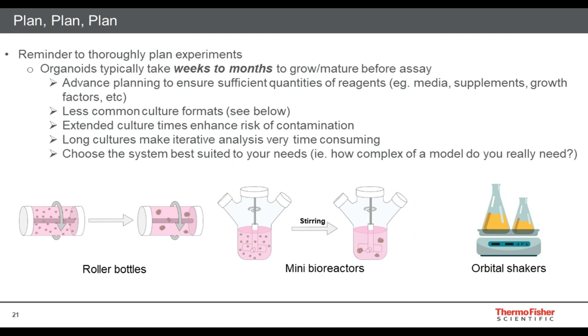The other important feature to remember with respect to the length of these cultures is that these really long or extended culture times really enhance or compound the risk of contamination. And I know in talking to lots of customers and collaborators who work in various types of models, although I'm sure people don't always like to admit to it, the longer you are doing something in cell culture, you're taking things out of the incubator many, many times, your risk of contamination just goes up.